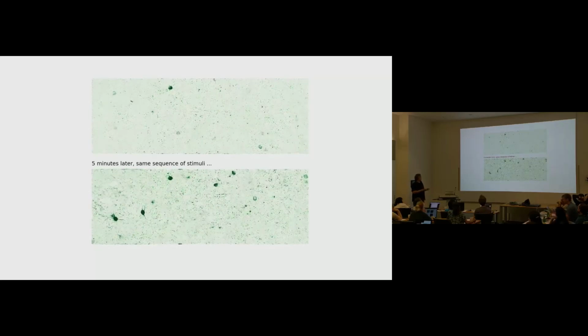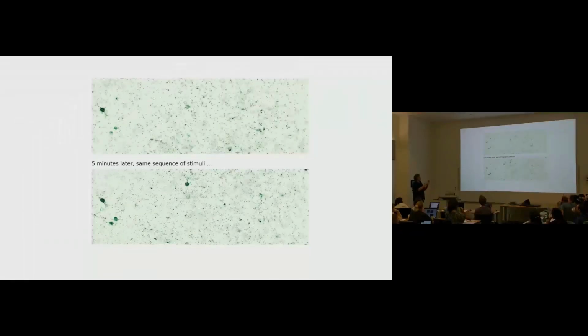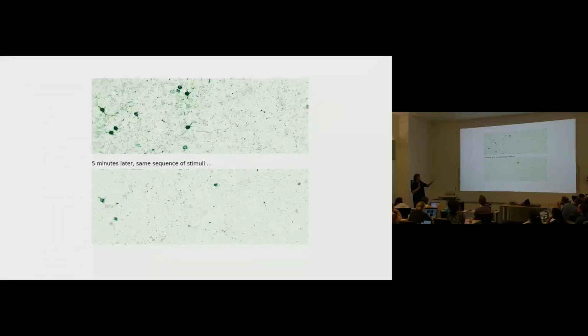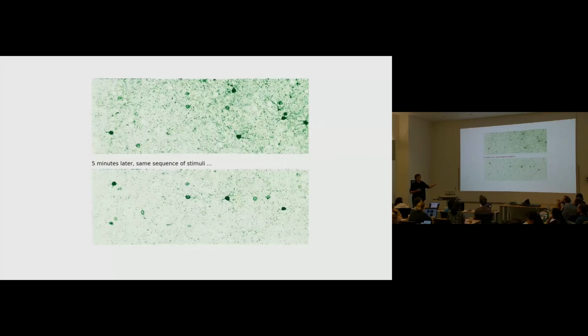So we're actually taking advantage of that when we do cell detection, because it means that if we see a group of pixels light up at one time, because cells are so sparsely active, it's unlikely that the nearby cells are active too. And so even just seeing it once on a single frame is pretty much enough to convince us, okay, there's a cell there. I just saw it lit up, right? So we built the algorithms to take that into account, basically.